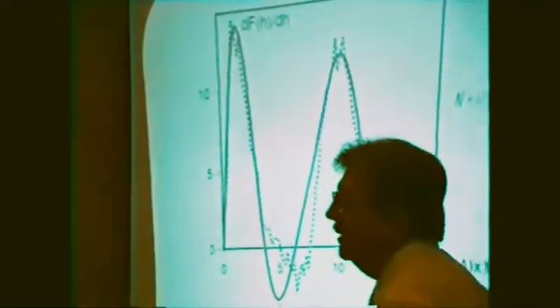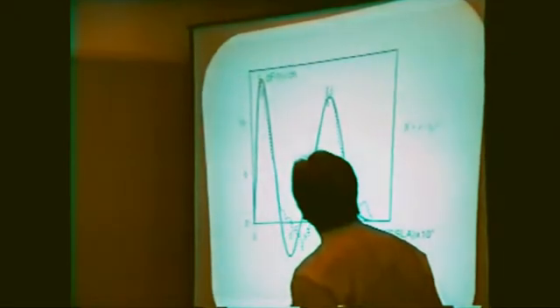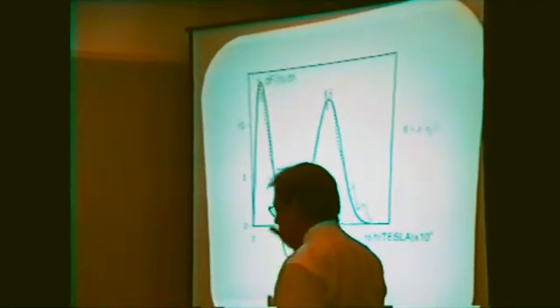In the other case, you have a Lorentzian distribution. And so we need the light blue and the rose line for simulating the OH. Now if you have exactly one molecule per acidic OH group, you need only one signal corresponding to the signal of hydroxonium. The simulation is not very good because the signal itself is not good, but no problem at all. When you have one water molecule adsorbed per acidic OH group, you form exactly one hydroxonium.